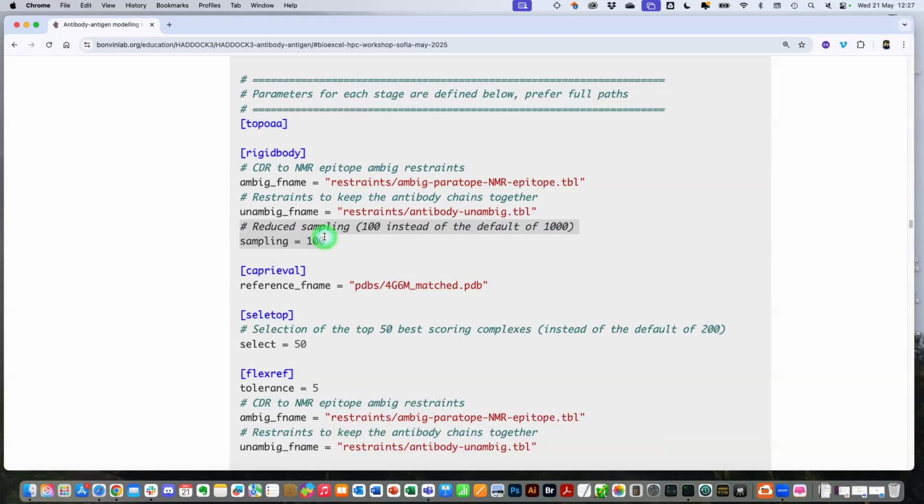So if you have a binding mode, which is a groove, you could think I could fit in this way or this way. And sometimes it's not easy to distinguish those two binding modes. Again, our distances are not telling us in which orientation it should bind. All orientations are possible. So internally, we do a sampling of 10, but we write the best model to disk. So when you say sampling is 100, effectively we have sampled 1000, but we write only 100.